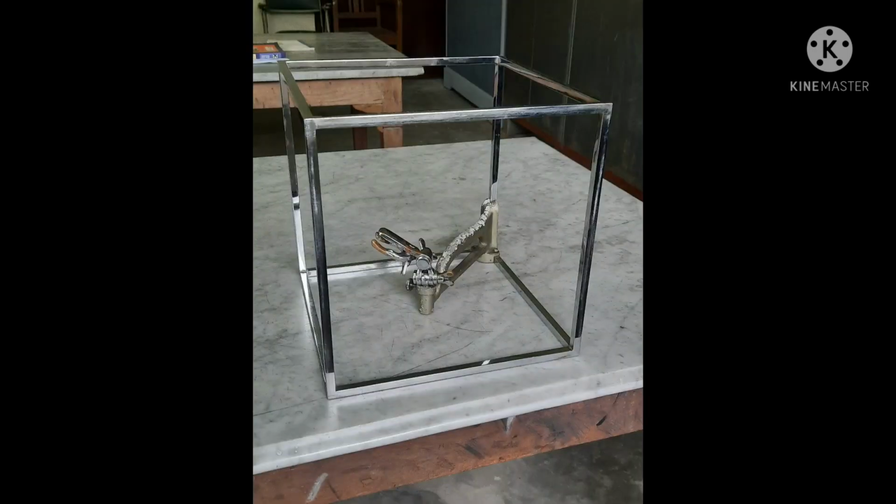For the purposes of drawing skulls with the help of a diagraph, a special type of craniophore called cubic craniophore is used. It is the skeleton of a cube formed by 12 metal bars. In the center of the cube, there is an accommodation for the skull holder.